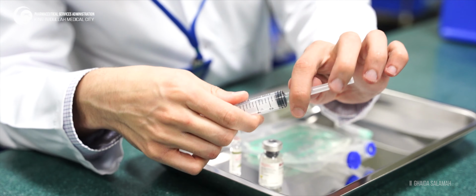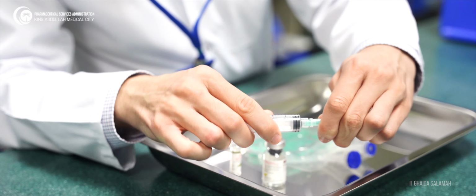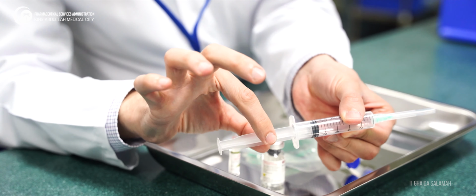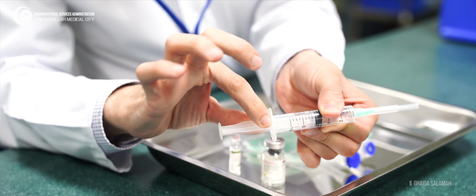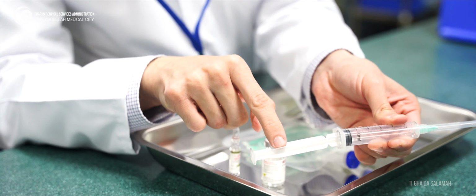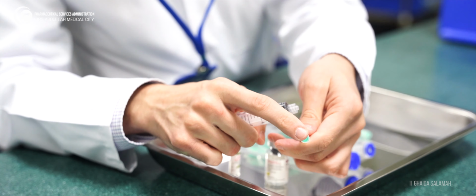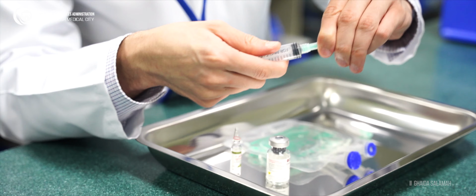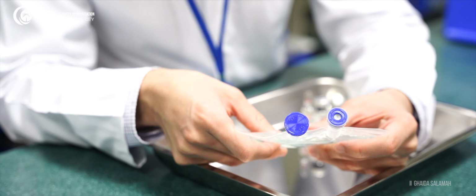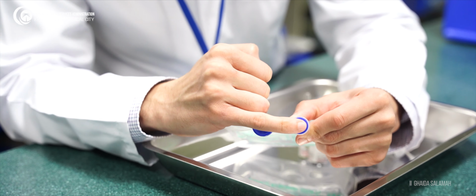For the syringe, the needle is a key part, the tip is a key part, the plunger is a key part. Any touch of the plunger or any other key parts will introduce contamination inside the preparation. That's why it should be avoided. For the bag, the key part is the injection port or the administration port.